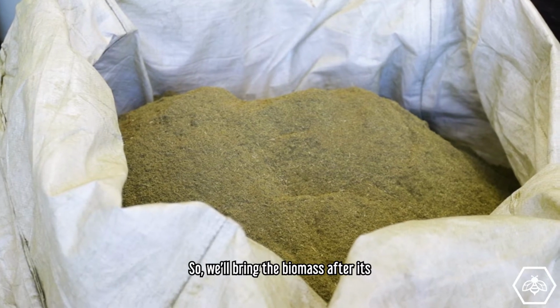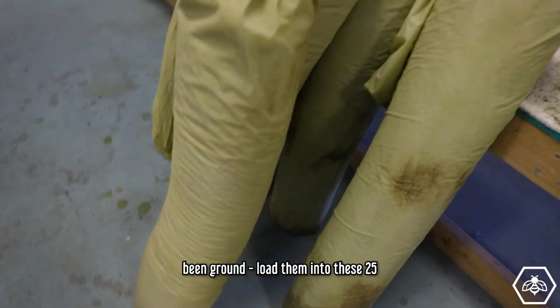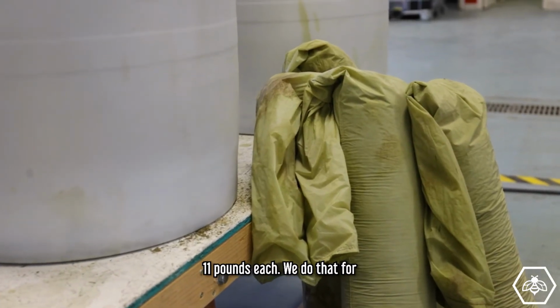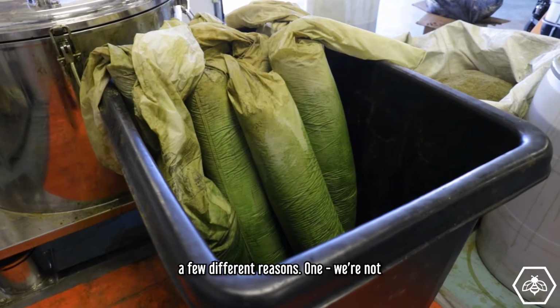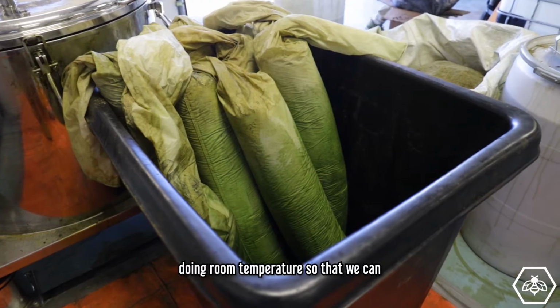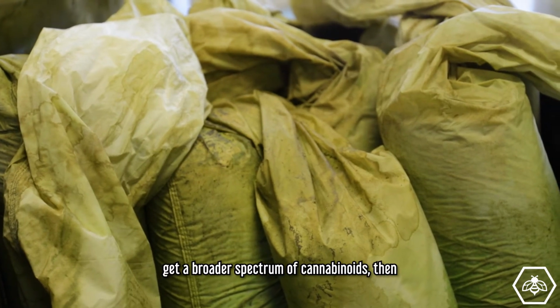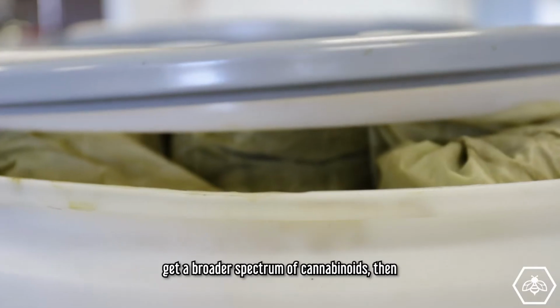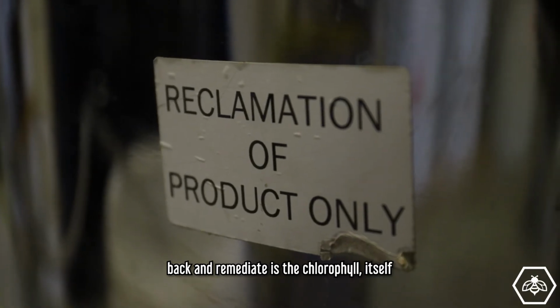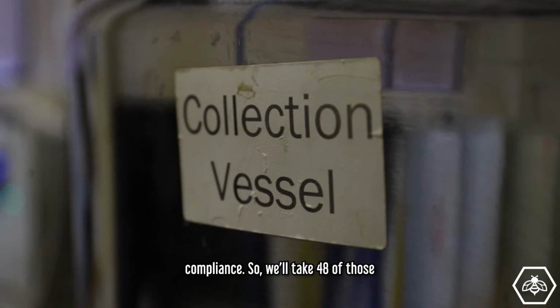So we'll bring the biomass after it's been ground, load it into these 25 micron socks. We weigh them out to 11 pounds each. We do that for a few different reasons. One, we're not using the centrifuge for extraction. We're actually doing room temperature so that we get a broader spectrum of cannabinoids, and the only thing we really have to go back and remediate is the chlorophyll itself, other than the THC to be within compliance.